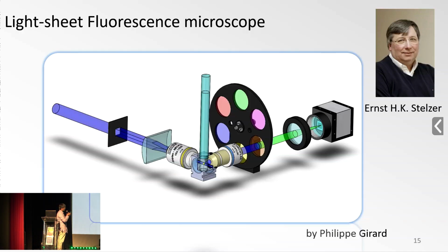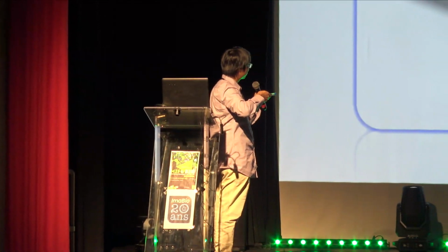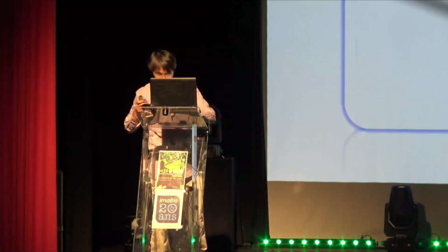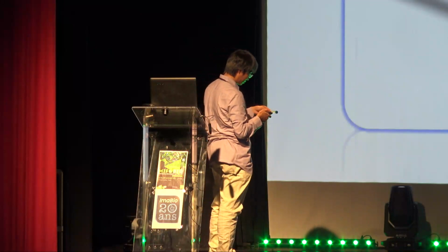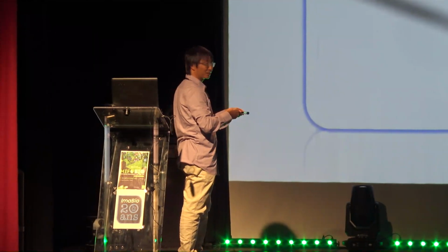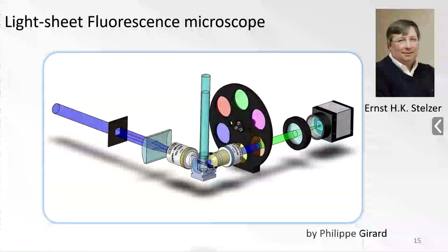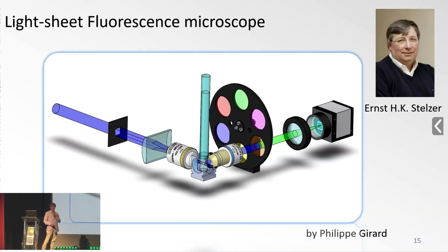So for example, if I put my laser beam here, basically, you can do light sheet from your home. I have been a postdoc in Ang's lab, and he always said that you can build a light sheet with a laser pointer and a cell phone. And I think now with this conical tube, it's really possible.